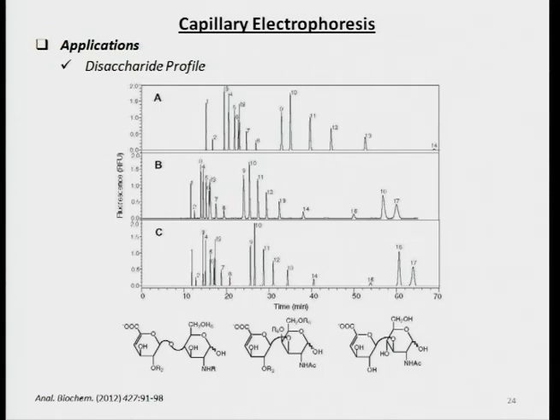In these disaccharides, the information about the uronic acid is lost. But for most purposes, what the authors did, recently published, was they took 17 disaccharides. So this is heparan sulfate. This is chondroitin sulfate. Okay, there is a galactose here. And this is glucose, this is 1,3. So this is hyaluronan. This is hyaluronan. Okay.